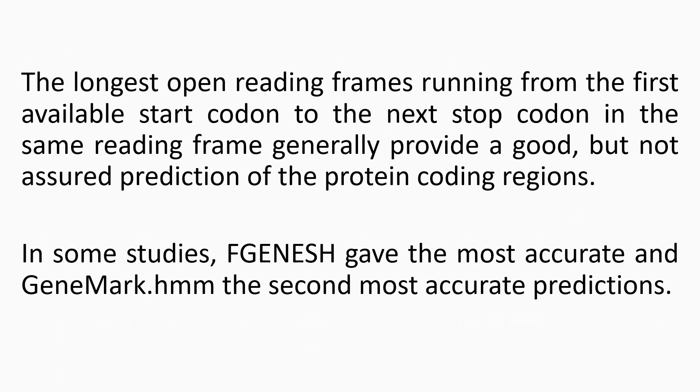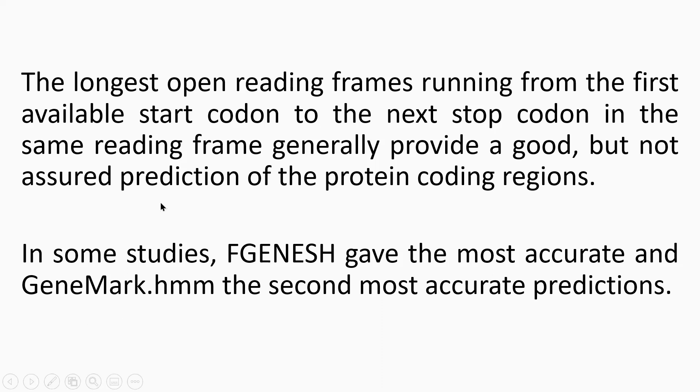So often, gene prediction programs will just look for the longest open reading frame. So this will be the first available start codon. So that's possibly the TTG that we saw initially, and that will then go through to the next stop codon within the same reading frame. So these are generally good, but as it's put here, it's not an absolute guarantee that the prediction that you get back is going to be right.